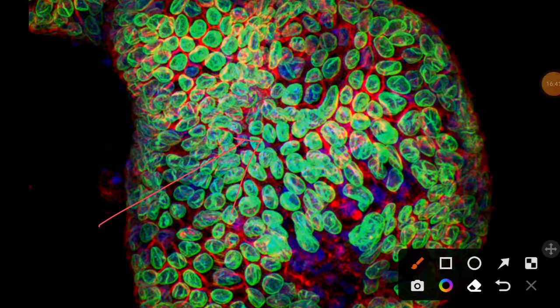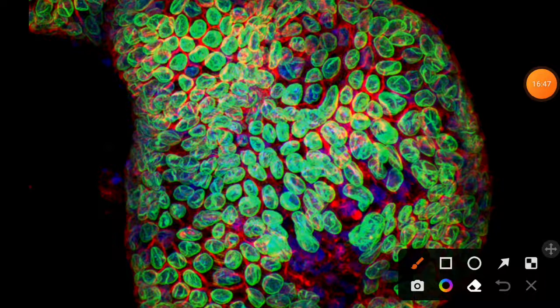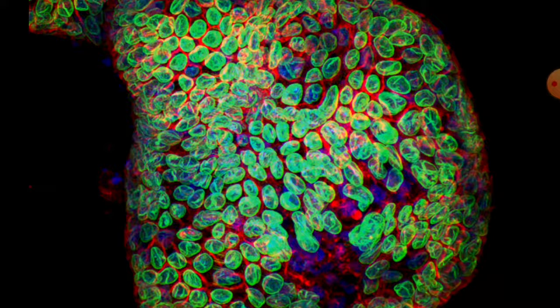Again let's revise. There is only one addition, that is the pinhole aperture, right? The pinhole aperture will allow only those rays coming from the plane of the focus, and that means remember that from each plane there will be only one light. The computer will use those digitalized information to construct a composite image.